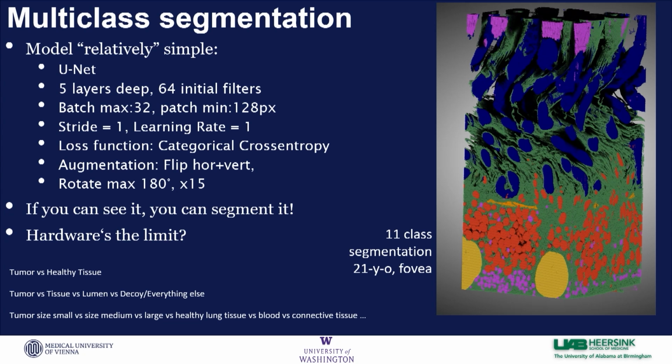This is a few days work basically of training, and I was able to get quite a nice segmentation. And our models, or the ones that we use, are relatively simple because we have one computer, and all of these segmentations were done with an NVIDIA Quadro 4000, so not super powerful. I've been quite jealous of some of the hardware I heard about today. So we were really pushing the computer to its limits with our five layers deep models. But I'll tell you a little bit about what we did to augment the data and everything later.